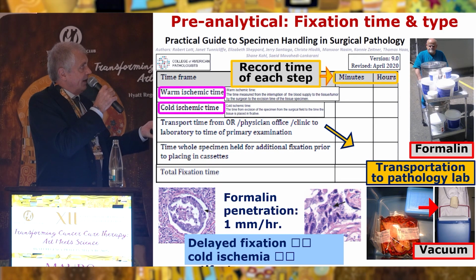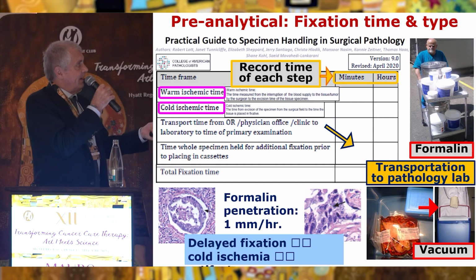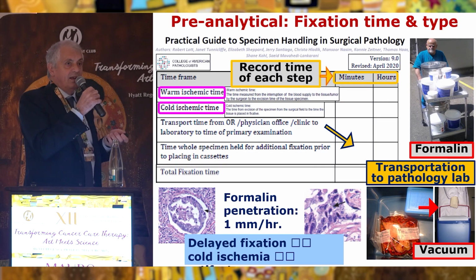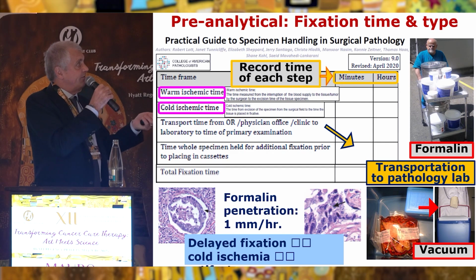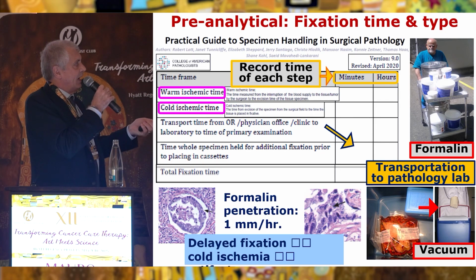This is our technician coming some 15 years ago from the surgical room theaters with this trolley with all the specimens under the sun, 35 degrees in June and July. And so the preservation of the tissue is somewhat a problem, and formalin is going to evaporate everywhere. So the hospital was full of formalin. Now our hospital is formalin free.